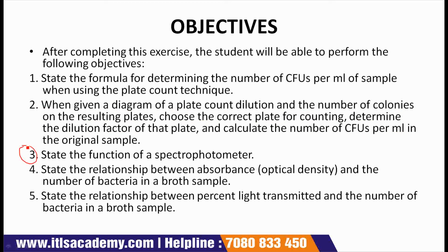Next point, state the function of a spectrophotometer. Remember, these are the objectives of the test that we are going to do, that is enumeration of the microorganisms.